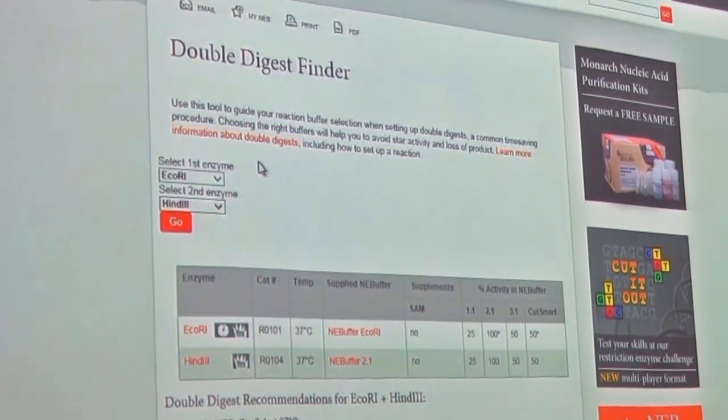So that's a really easy step, and you can get all of your restriction enzymes from New England Biolabs, and they send with it the buffer and everything like that. So that's actually one of the places that's on this cloning cheat sheet I gave you, so that you can look up different enzymes. It'll also tell you what the restriction sites look like and things like that.